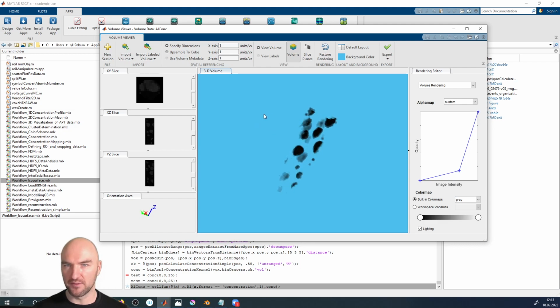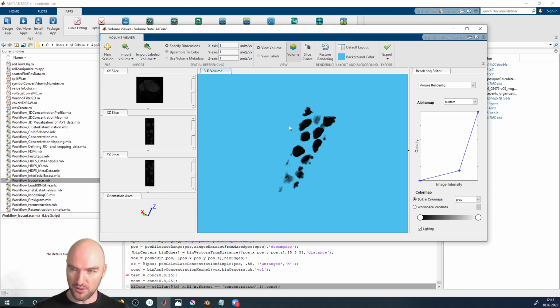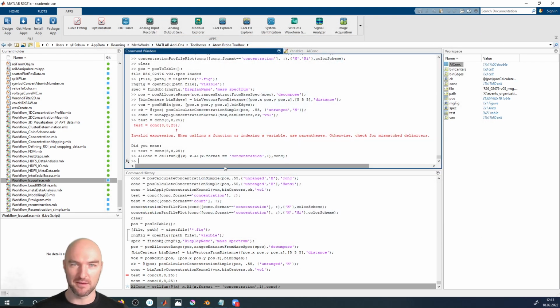Maybe we'll rerun the voxelization with half the voxel size. The problem with that, of course, is we're in 3 dimensions, so half the voxel size means 8 times the voxels, so an order of magnitude more voxels in the end. But let's do that, otherwise our outline is maybe not all that great. Or maybe we go 3 nanometers.